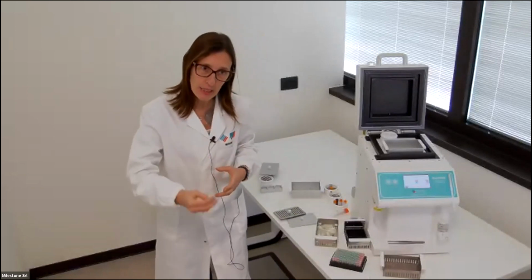The system keeps the ending temperature for an unlimited time. So you can also run an over-weekend program. Also, if it is only a 2 hour program, then the system will keep the -80 temperature until Monday morning.